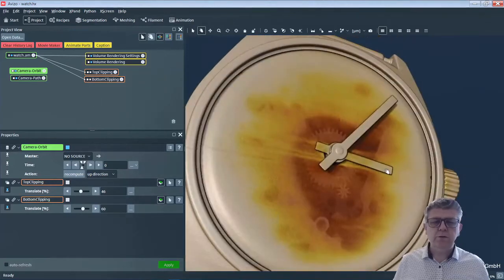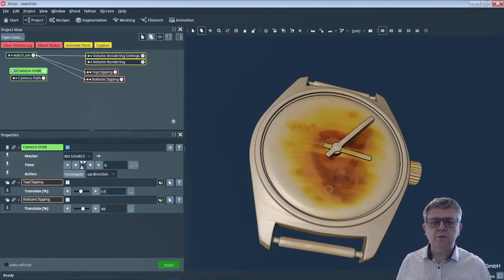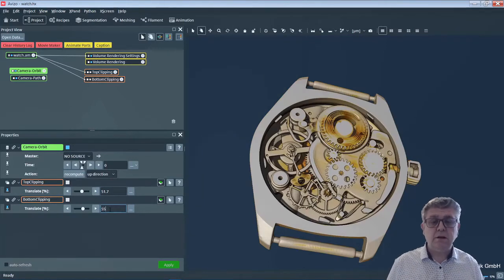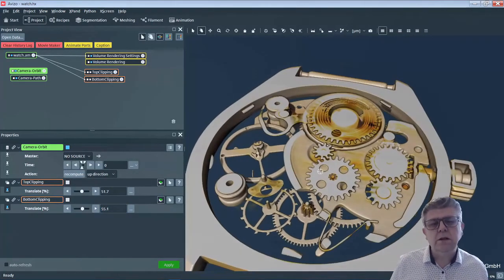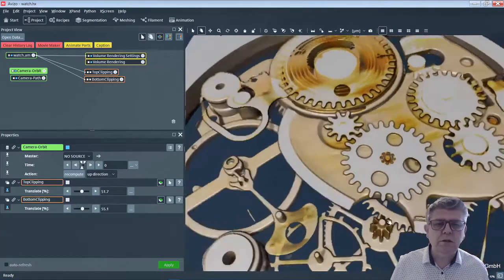You have to play with the viewpoint changes, or interact with your data, like cutting, and see if you suddenly have some artifacts. Okay. I think we can skip this part a little bit, but basically I'm going to zoom in and you will see no artifact.